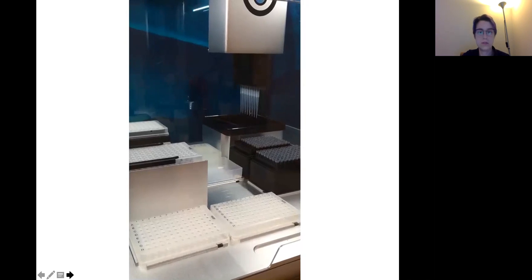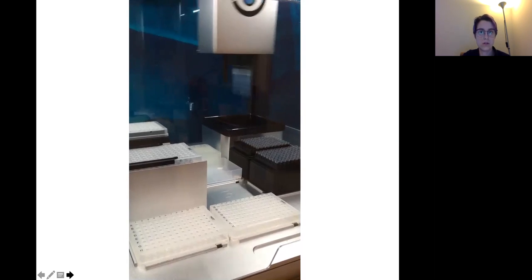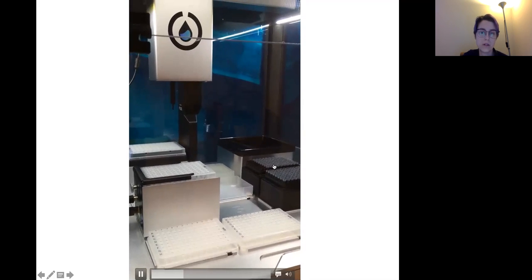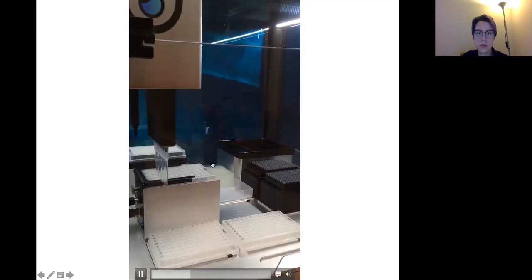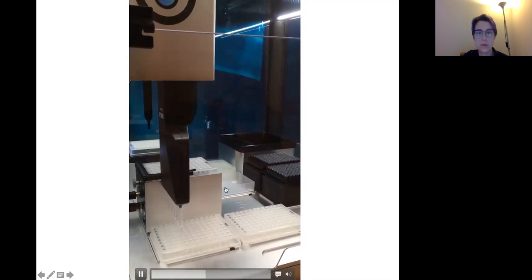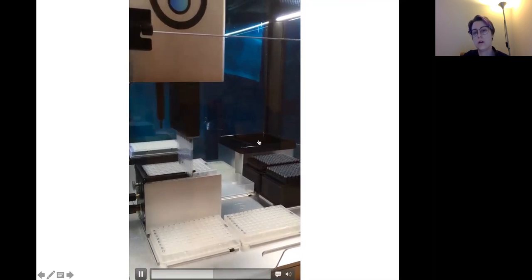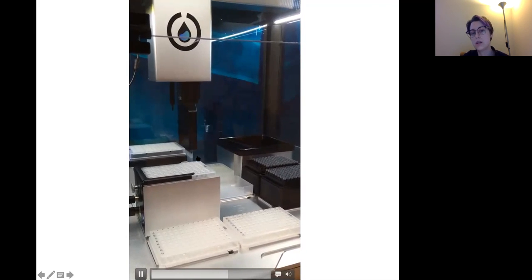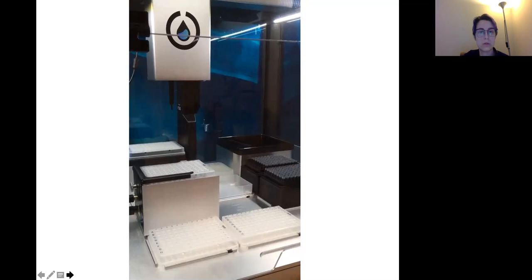And here there's another video of the OpenTrons. It picks up tips. These are the tip racks you can see here, and these are various liquid reservoirs, and here it pipettes. I think it's the same video, and this is the trash bin, so it drops the tips there in the end. Here it doesn't because it was just pipetting water.